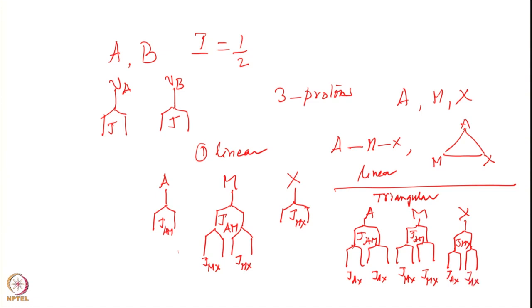Therefore, depending upon the nature of the coupling, you will have different patterns. This is easy to understand on the same principles as I showed you in the previous case. Typically one understands this in terms of the energy level diagram. Energy level diagrams can be drawn in a simple way, so let me draw the energy level diagram here for you.